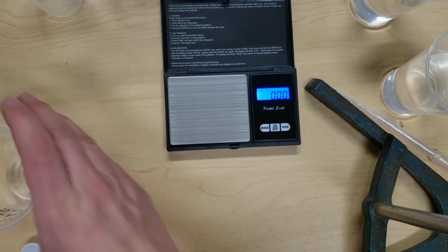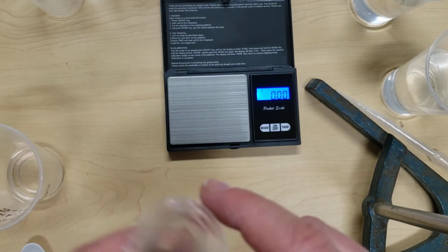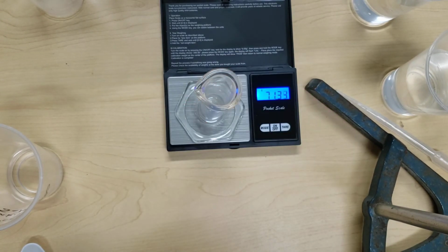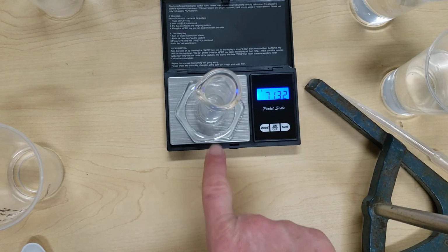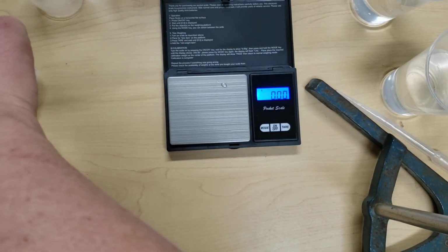We're going to record the mass of the graduated cylinder, and that way we can find the density of our unknown solution, which we'll be using with our calibration curve in order to figure out the percent mass.